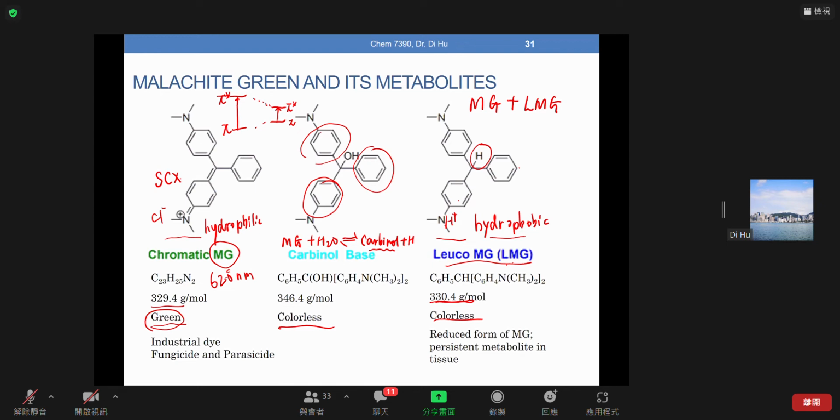So when you elute the sample, think about it. What kind of eluent do you want to use, the mobile phase for eluting from the SPE? Basic methanol or acidic methanol? Already forgot?